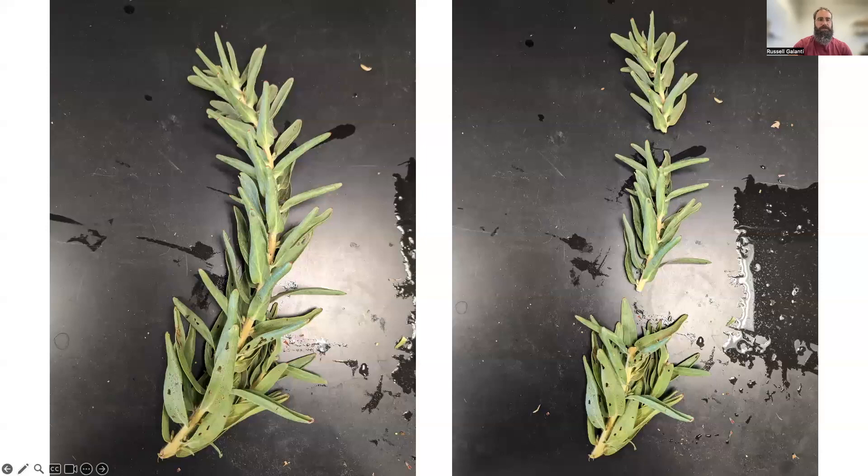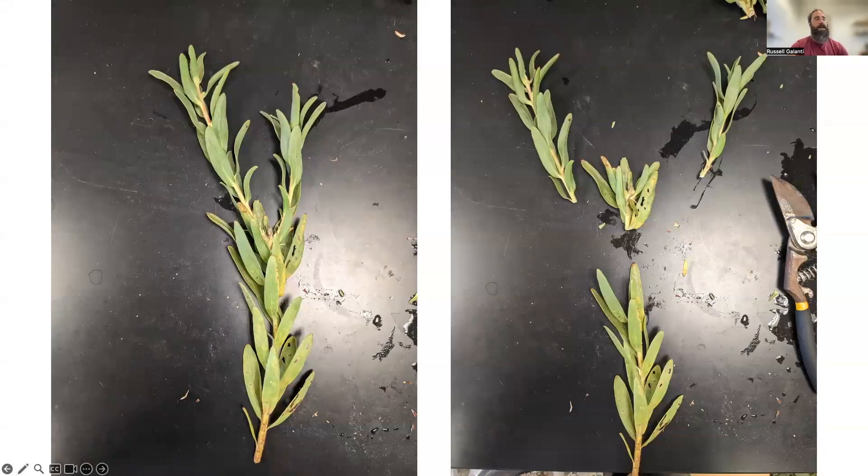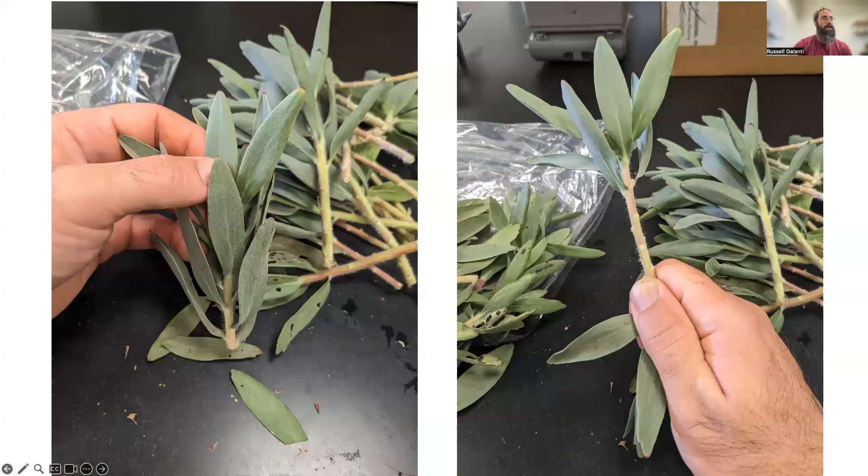If you've got branched stems like the one you're looking at here, you can process it in a similar way. I'll turn each of the branched sections into their own cuttings, and take the bottom and turn it into a cutting itself. You can see this is about six to seven inches, so I'll cut it back, prune off the bottom, and use the top four to five inch section. I discard the branched area — you can attempt to root any of the material, but I like nice clean stems to create good plants.